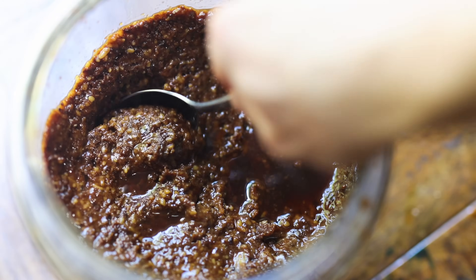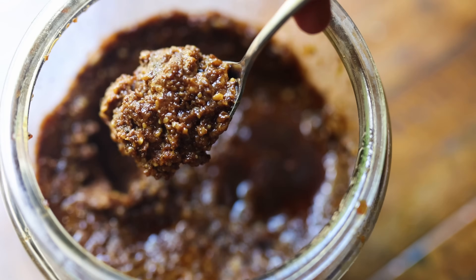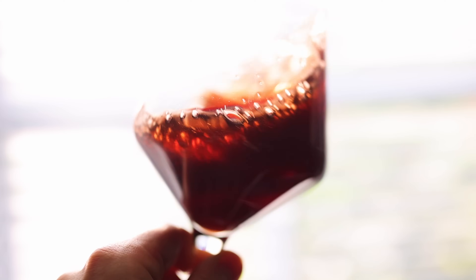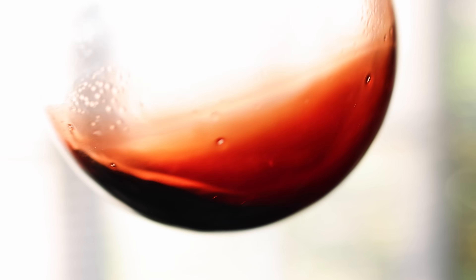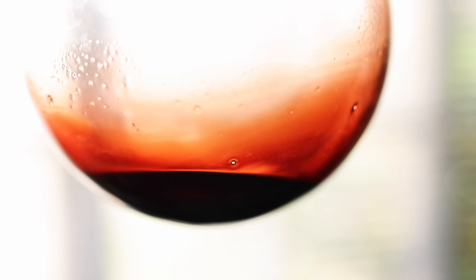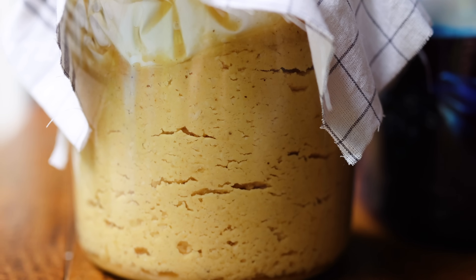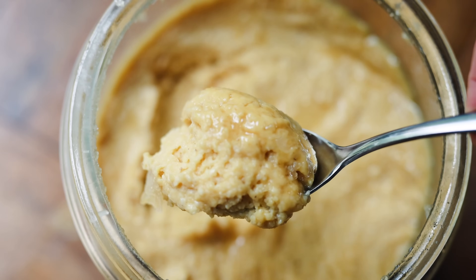You can also use the Rotavap to make modern tamari analogues, inspired by Noma's method, where they blend a miso with a liquid, clarify that, and then reduce it down to concentrate it into a flavorful tamari. Again, being able to do this at low temperature means you're preserving more delicate aromatics and freshness of flavor. I've made a masa corn miso tamari this way, which is really delicious and sweet and salty, and a gooseberry and roasted yeast miso tamari as well, which is something I'm working with at the moment.